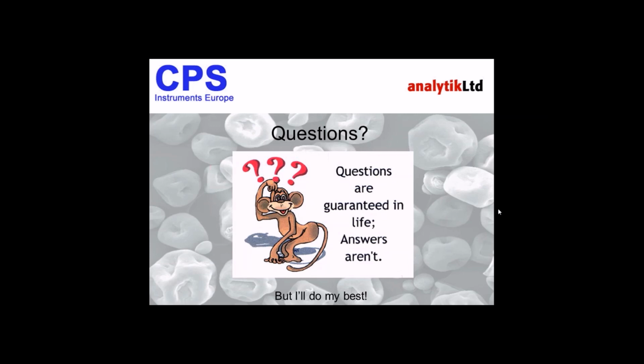Someone's asked, can you collect the fractions? Yeah, how many times have I been asked that question? It would be wonderful if you can. Unfortunately, the answer is no. This is an analytical disc centrifuge, so there's no way to siphon off those fractions. So it's not a preparative system. We cannot collect those fractions.